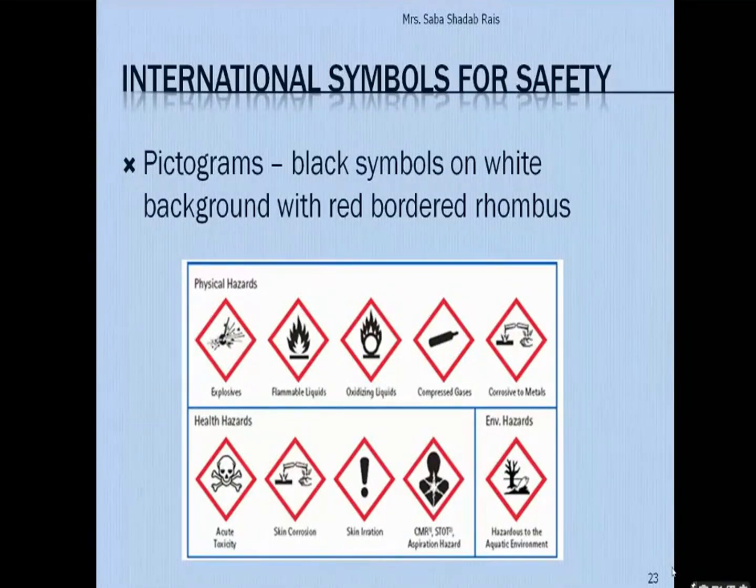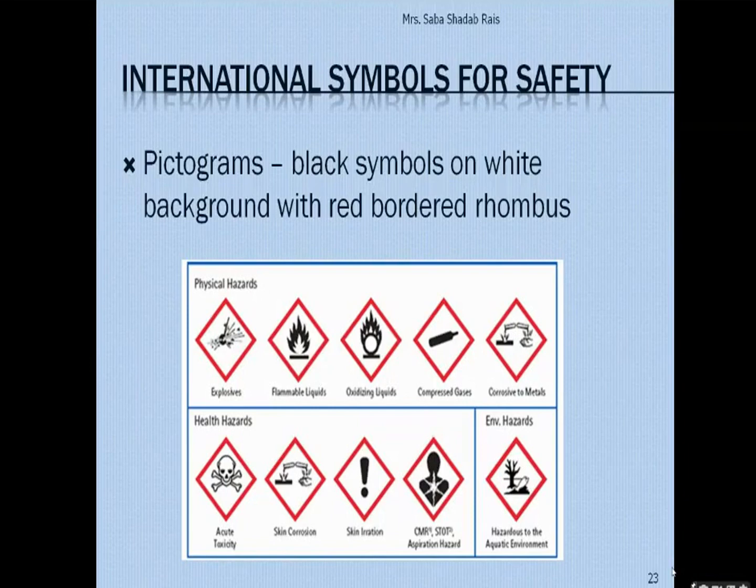When we talk about your class, the FIBSC class, you have a higher student-teacher ratio. For that reason, you should be aware and trained about the precautionary steps to avoid any type of mishaps in the laboratory. The label on the chemical bottle should be observed carefully, and different safety measures should be adopted while performing the experiment as per the nature and hazard related to the chemical.